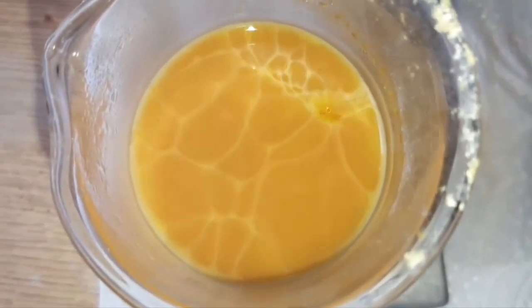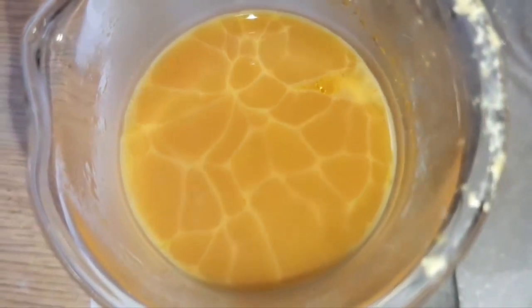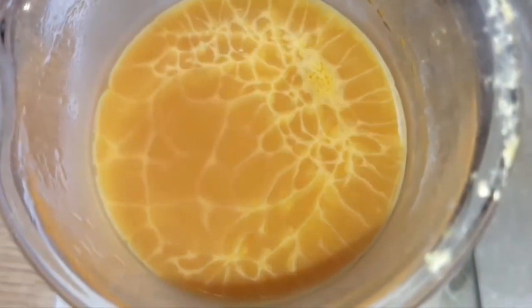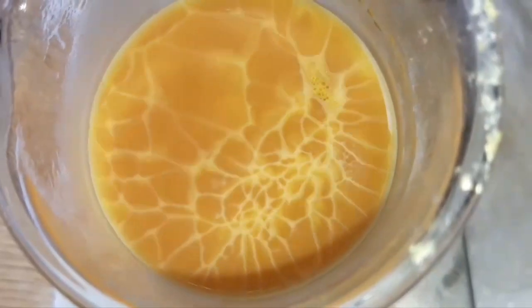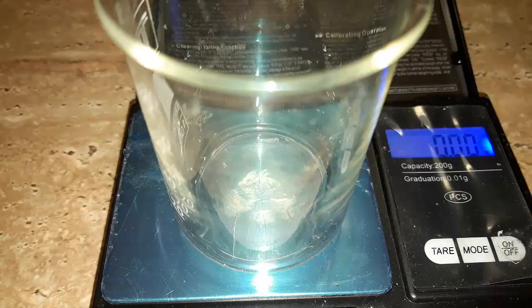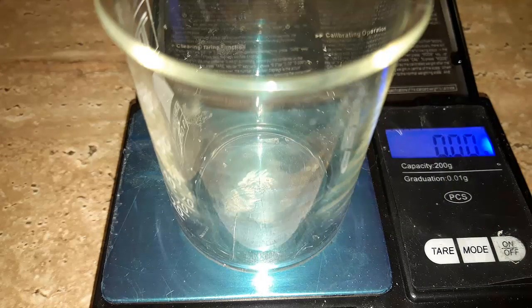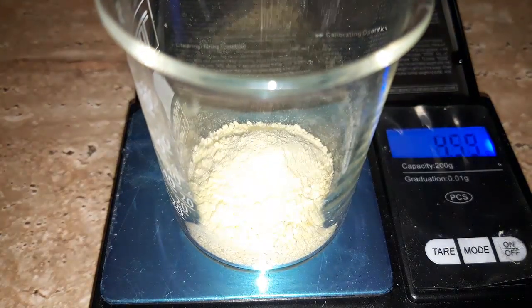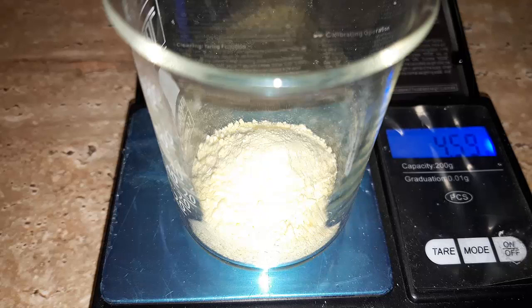During the recrystallization I got some funky looking patterns. After filtering and drying it again we got 4.6 grams, which is a 75% yield.